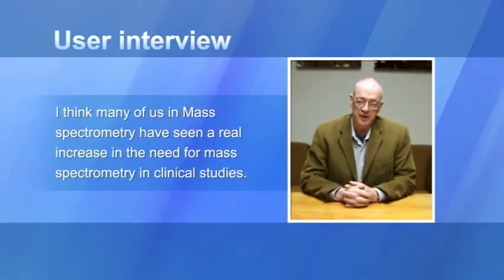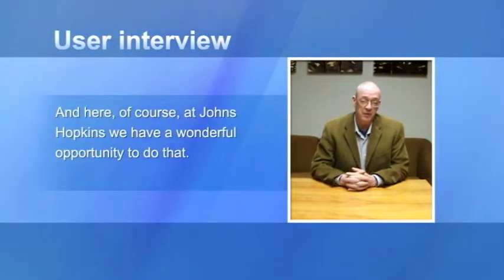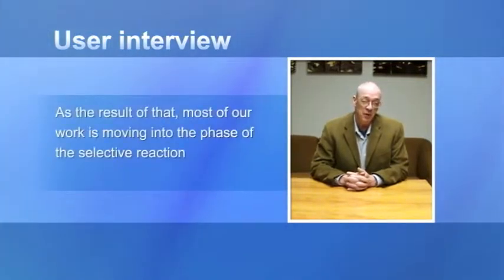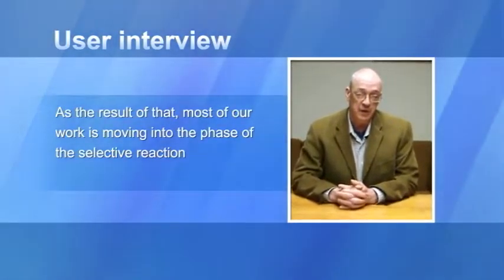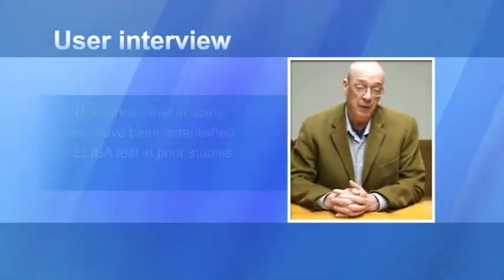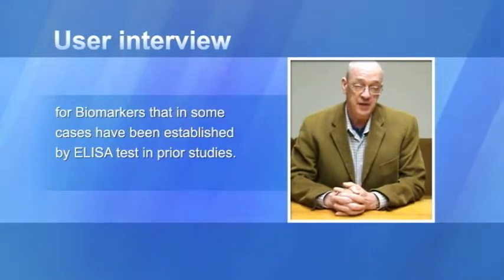I think many of us in mass spectrometry have seen a real increase in the need for mass spectrometry in clinical studies. And here, of course, at Hopkins, we have a wonderful opportunity to do that. As a result of that, most of our work now is moving into the phase of doing selected reaction monitoring with biomarkers that in some cases have been established by ELISA tests in prior studies.